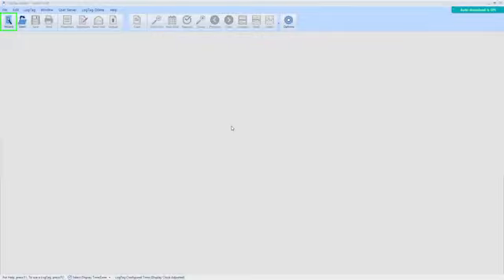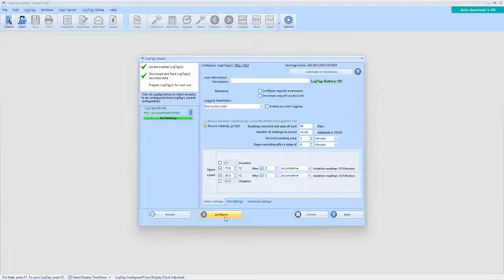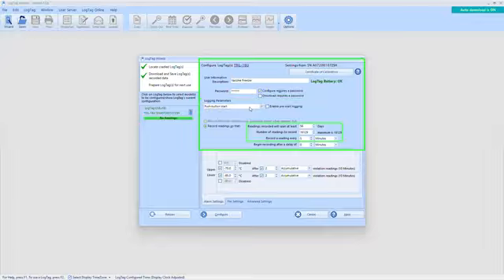Next, navigate to the wizard button in the top left of LogTag Analyzer. LogTag Analyzer will read your computer and prompt you with the following screen. Simply click Configure to proceed with the setup. This will land you on the configuration pane. The configuration pane allows you to set a user ID, password settings, start method, logging interval, and start delay.